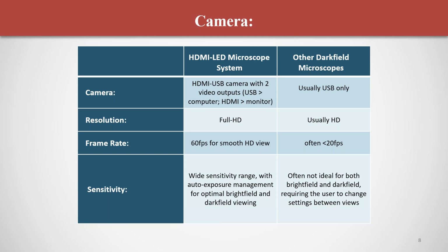So again, then you end up compromising, and you would usually then reduce the resolution to get a higher frame rate, and then you don't really have an ideal system again. And then lastly, on the camera as well, sensitivity is really important.